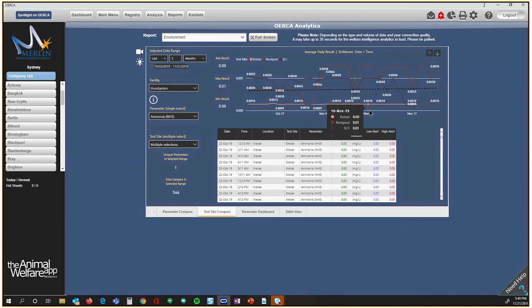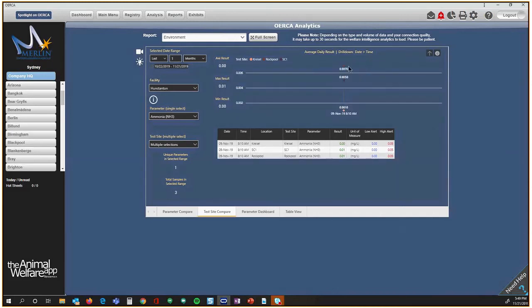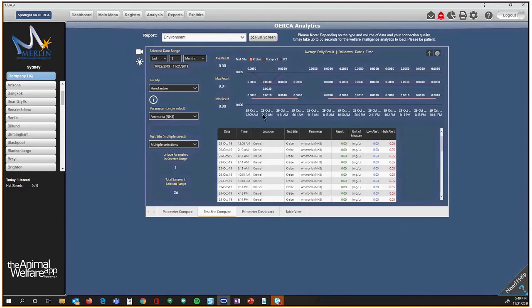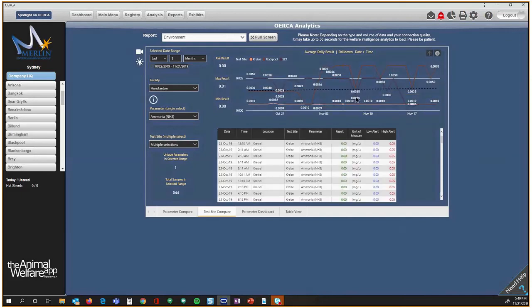It takes me from looking at the entire day to the different times within that day. So if there are 2 or 3 records for that day, I can click on the drill down, and you're going to see it changes into a little circle goes around it. Now if I click on these, the entire graph will change, and there's only one result for each of these. But you can see if there were 2 or 3 or 4, it would show me the listed times across the bottom, and now I'm reporting on a specific day. Let me click on one more just to see if I can get one maybe that, yeah, this one has multiple done throughout. This must have been Sinai reporting. So you can see how that works. And then if I need to drill back up, I just hit the up arrow key.